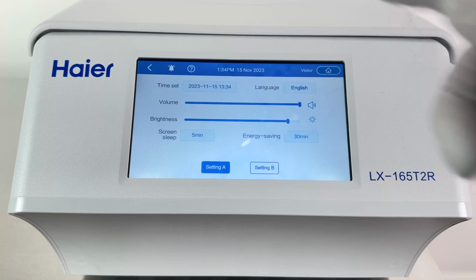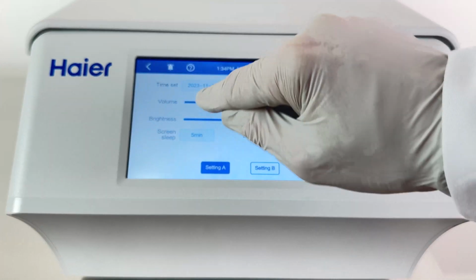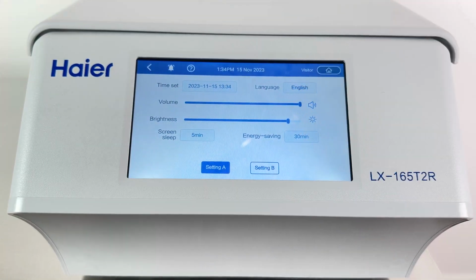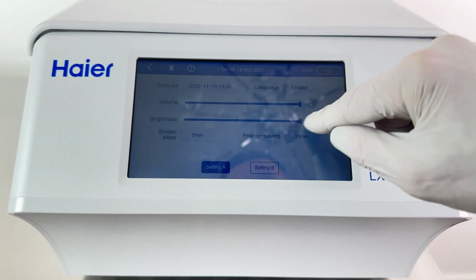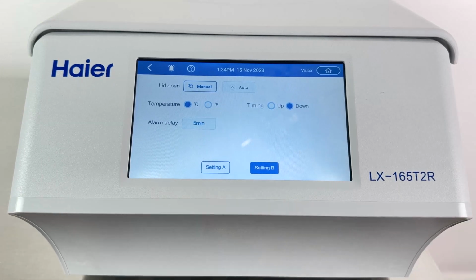Here you've got some settings, so the date setting, how quickly the screen goes into sleep, and then how quickly it goes into energy saving. You've got volume as well, and I would always say that the louder the better for an alarm, and you can alter the brightness as well. So if you are in a very dark lab, you maybe don't need it so bright.